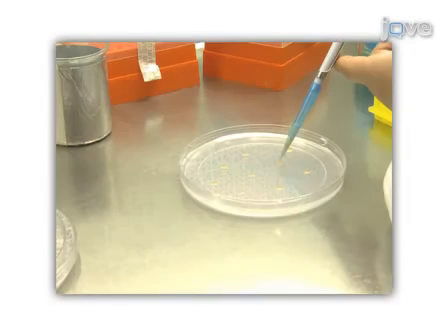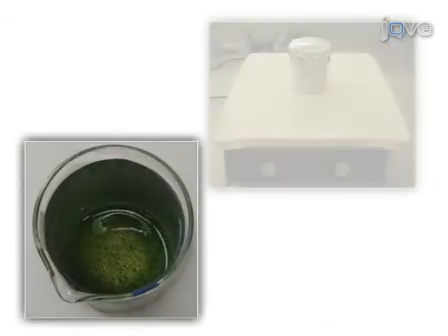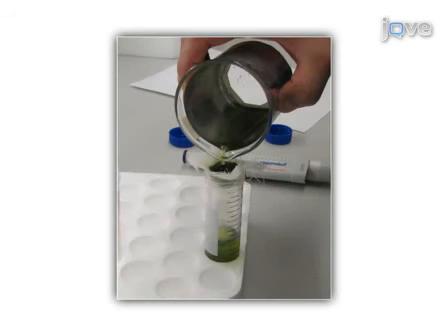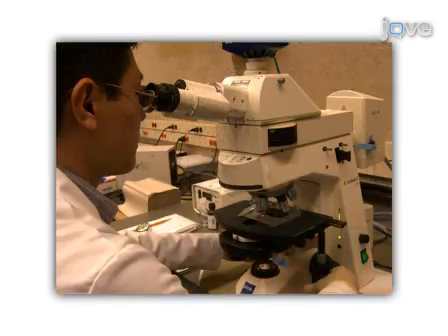This procedure begins with plating Arabidopsis seeds on MS agar. On day 14 after the seeds germinate, the seedlings are collected and sliced. The plant material is then digested in an enzyme solution, breaking down the cell wall. The resulting mixture is sieved through cheesecloth to separate the protoplasts. The collected protoplasts are further purified on a sucrose density gradient by layering them with W5 solution. The protoplasts concentrate at the interface of the enzyme and W5 solution, then are collected and washed before experimenting.